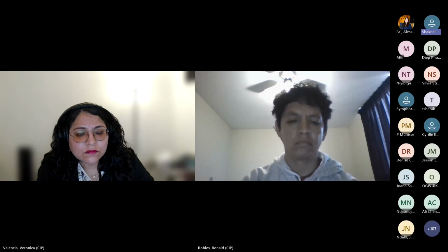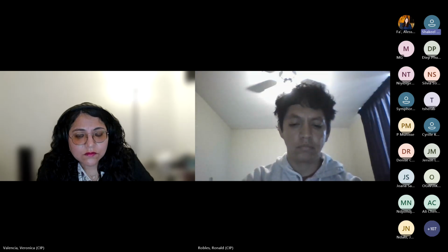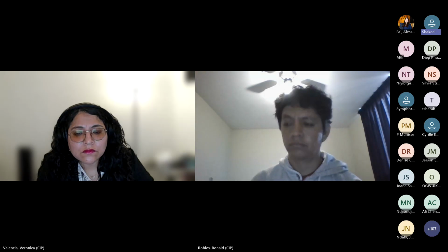My first question is whether there is any optimum ratio for the usage of liquid nitrogen with respect to the tissue or the time. How much time we should grind, how much quantity we should use.